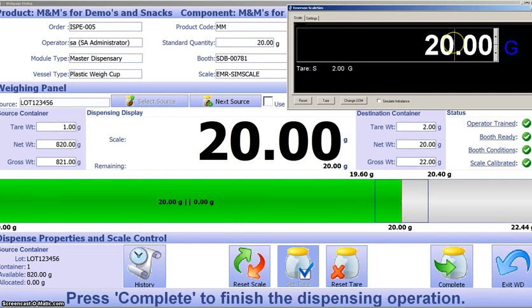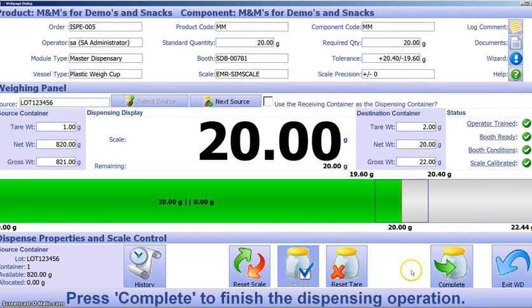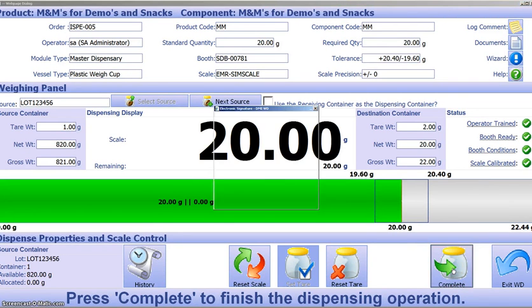The system supports dispensing into multiple containers, but today we'll just dispense into one. Once the material is all weighed up, we press complete.